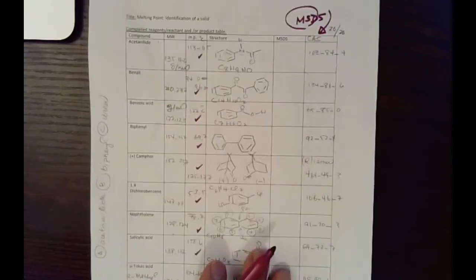And this page is what I said. I usually do it myself before the lab. So I looked up the structure, look up the registry numbers, etc., etc. So use this to fill out the other lab report.